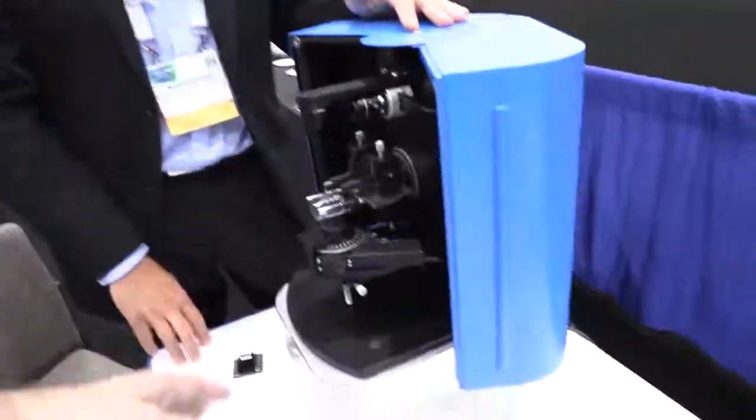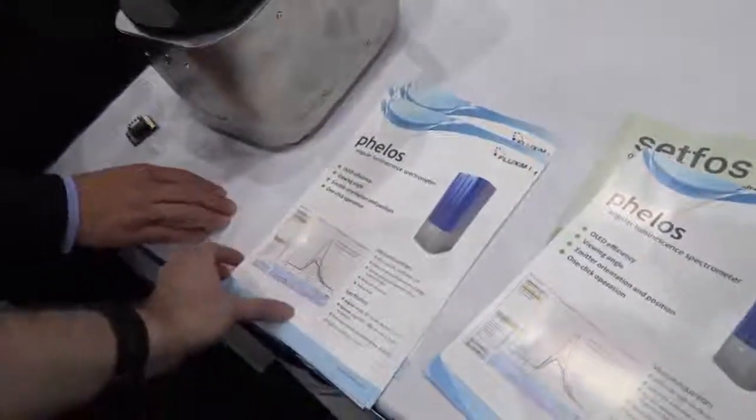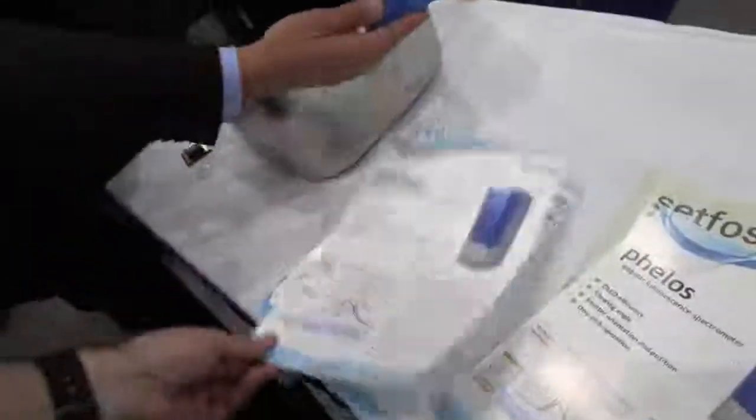So this is the Phelos. Phelos, yep. And this is for these kinds of companies to buy? Yes. And they put it in their labs? Exactly, in their research labs, so they can prepare the next generation of OLED displays.